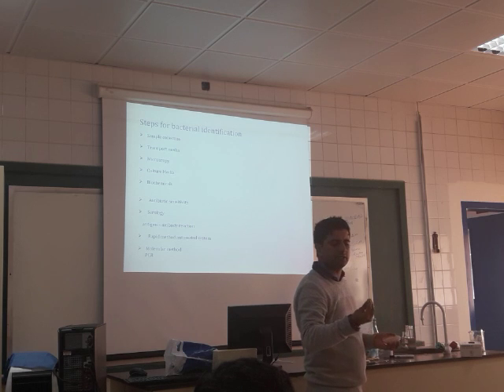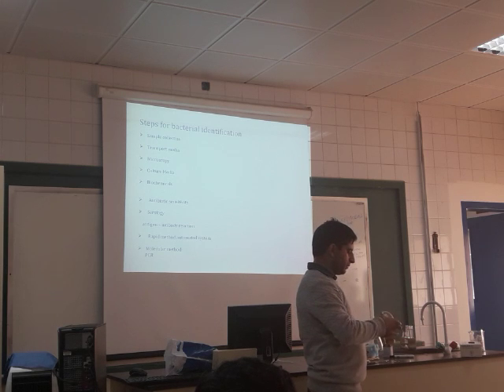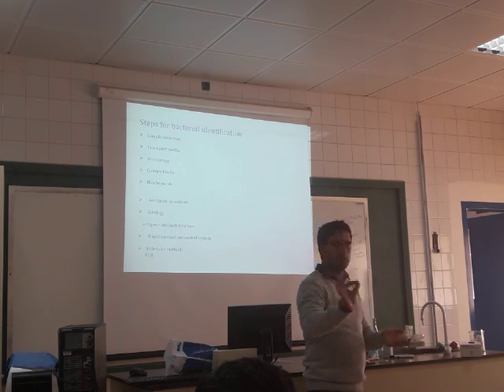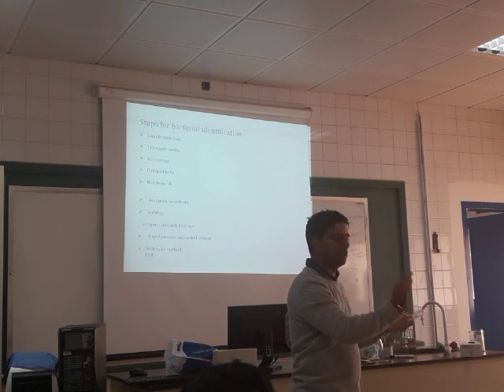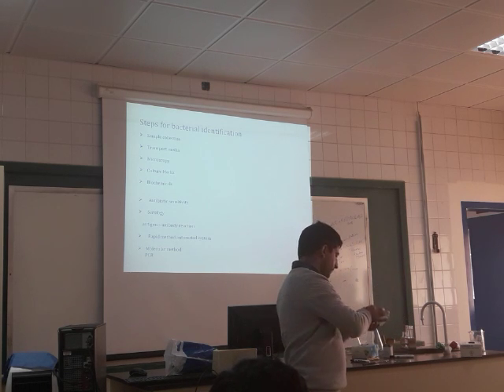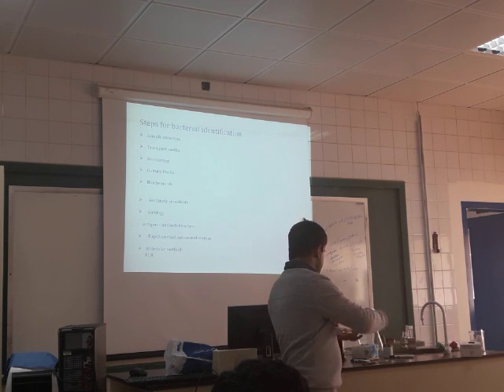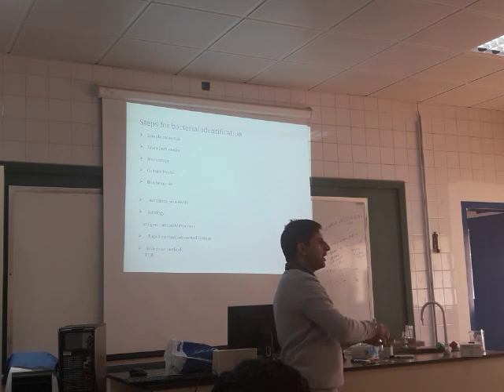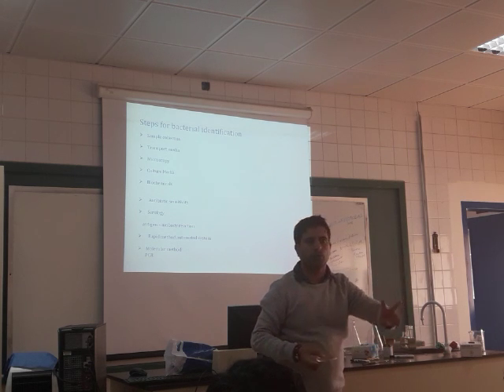This is the antibiotic disc. It contains antibiotic. One by one, we put the antibiotic discs here. If you are suspecting the bacteria Staph aureus, you put Staph aureus here. Then you put various types, penicillin, vancomycin, one by one, with a proper procedure, not by hand. Similarly, you keep it under incubation in the incubator for 24 hours.